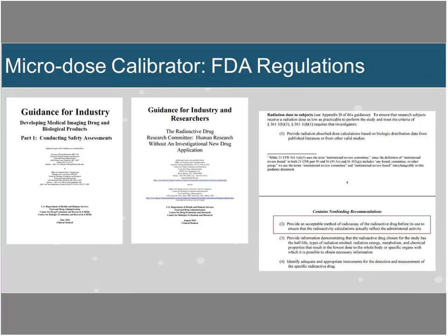Now, I think this problem that I've stumbled across is one that people haven't really brought to light, and I think bringing this device to market and announcing the availability of this new technology is going to shed light on the fact that we're not making good measurements. And so I think the FDA could come in and see this and start requiring better measurements, or actually prove that you're making appropriate measurements at these microdose levels. Okay, great. Thank you for that.